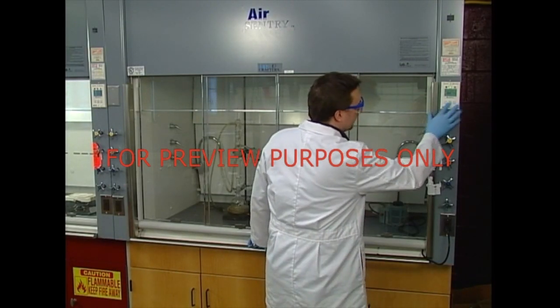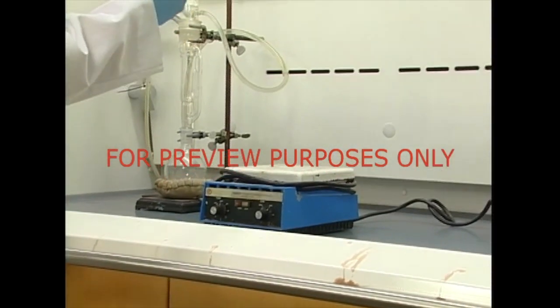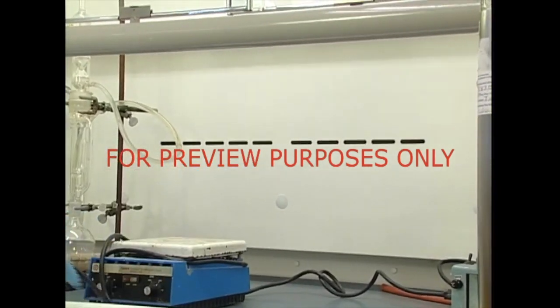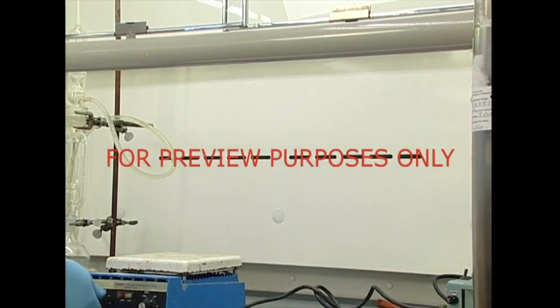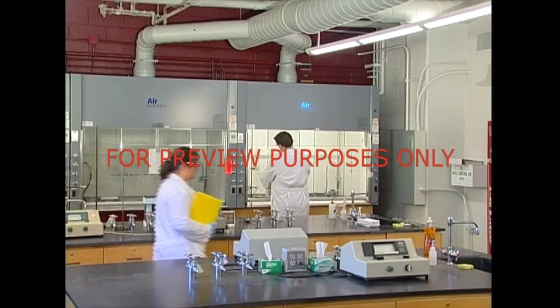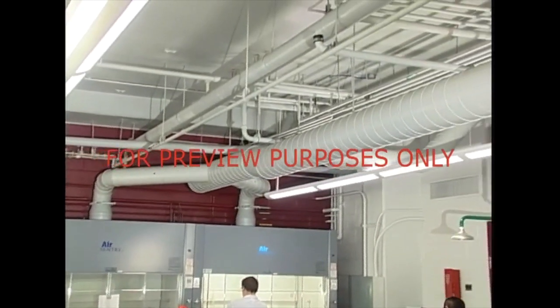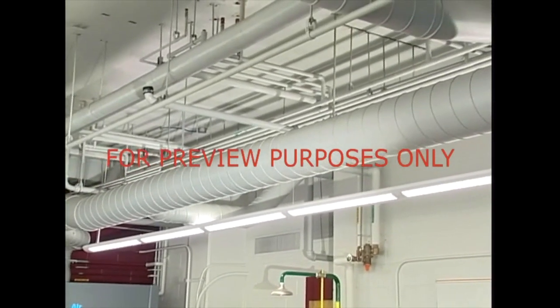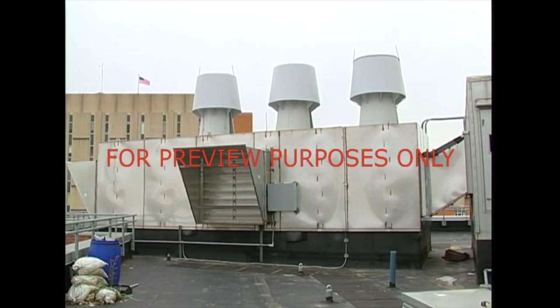Exhaust hoods protect us by preventing contaminants within the hood from entering our breathing zone. A protective barrier is created by air that's pulled into and through the hood. This inward airflow helps keep hazardous fumes and vapors from escaping and reaching anyone outside the hood. Contaminants that are captured within the airflow are filtered, diluted, and exhausted through the hood's duct system. This air is then sent outside the building, where the contaminants are further diluted into the atmosphere.